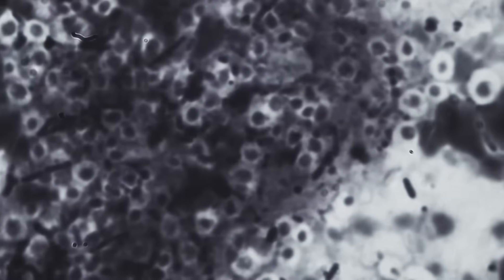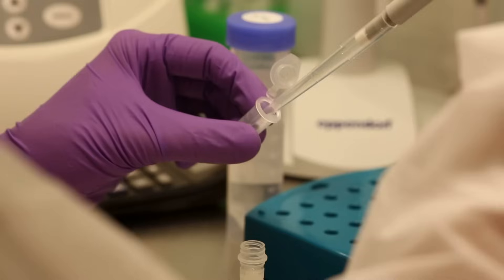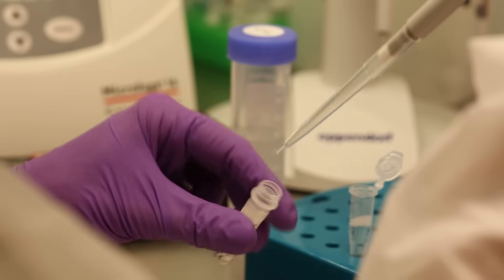How do you verify your quality control? Are you confident that there's no contamination in your products? What if you were audited and had to send samples to a third-party testing lab? Are you confident that your products are clean? Let's find out how.